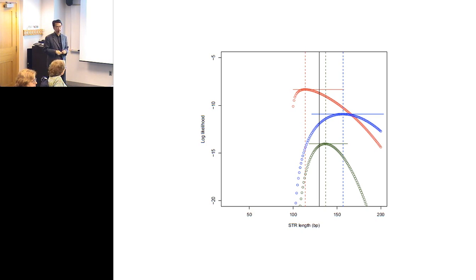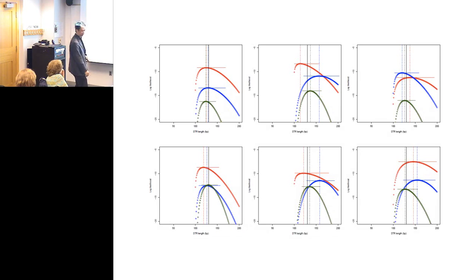So Margit, we wrote quite upfront about the limits. We set ourselves out to deal with, first of all, a pure repeat, where the unit is a singular one repeated many times. You don't get to switch in the middle of it. And then the two ends are flanked by truly genome-wide unique sequences. And then you don't have two STRs jammed so close that they would compete for the unique sequences in between. So there's a host of abominations that we excluded. We say we don't deal with those. So that's additional work in Peter's hands.